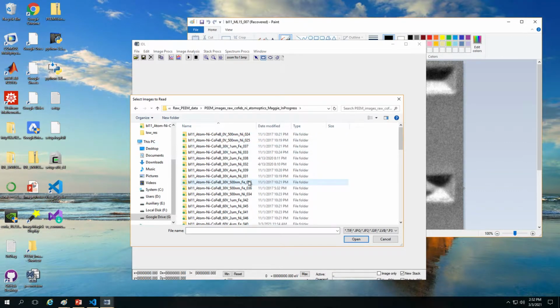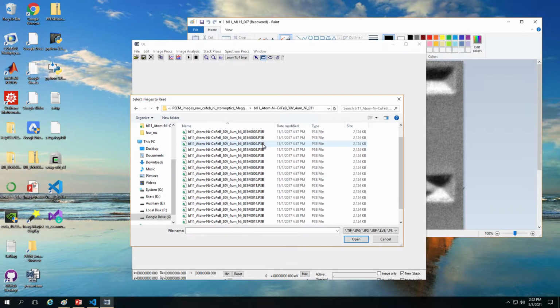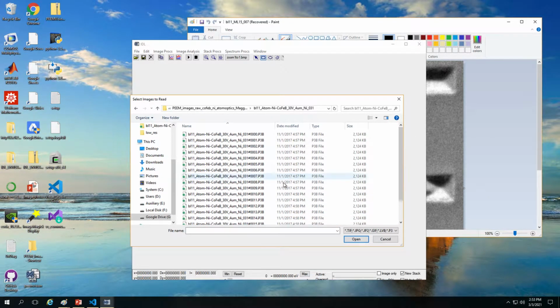So let's start with an example here. Say we go to file number 31, and as you will see here, usually we would take from 0 to 19 index, so 20 images total. In this case, usually we take 10 images first, from 0 all the way to 9, with one of the circularly polarized polarities of the X-ray.